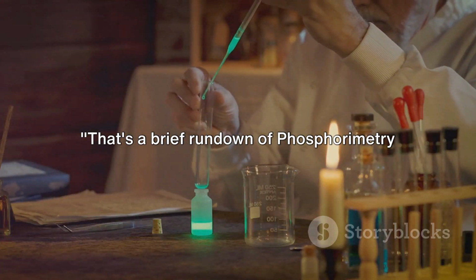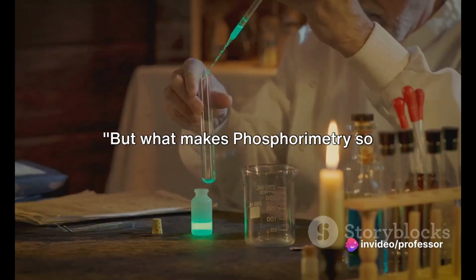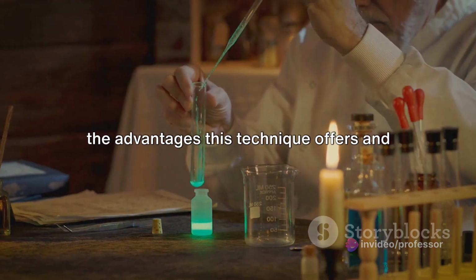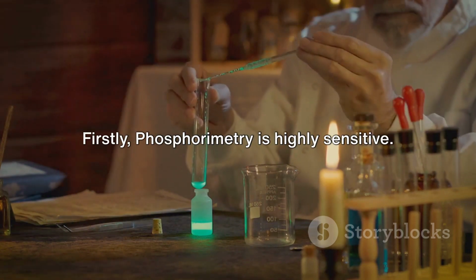That's a brief rundown of phosphorimetry, another intriguing aspect of molecular luminescence. But what makes phosphorimetry so important, you ask? Well, it's all about the advantages this technique offers and the wide range of applications it has in various fields.